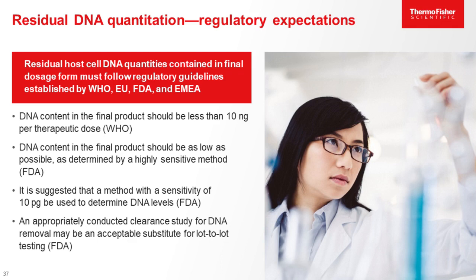Residual DNA quantitation may be performed at various stages throughout the downstream process, starting with the cell culture harvest all the way down to the final product, in order to monitor DNA clearance. So the reason why you should be concerned with the amount of residual DNA left in your product is that we know that DNA can impact product quality, efficacy, and safety. Regulators around the globe therefore require you to limit the amount of residual DNA in the final dose.